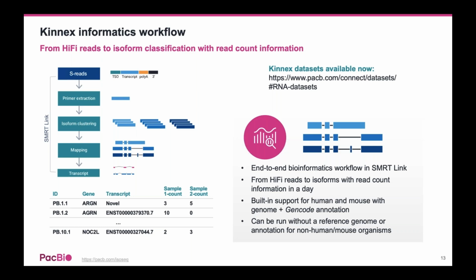Also, if you'd like to take a look at the data yourself, please check out the datasets page of our website in the top right here, where you can find both full-length and single-cell Kinnex data. And very soon we will have the data that Kim is showing in today's talk available as well.